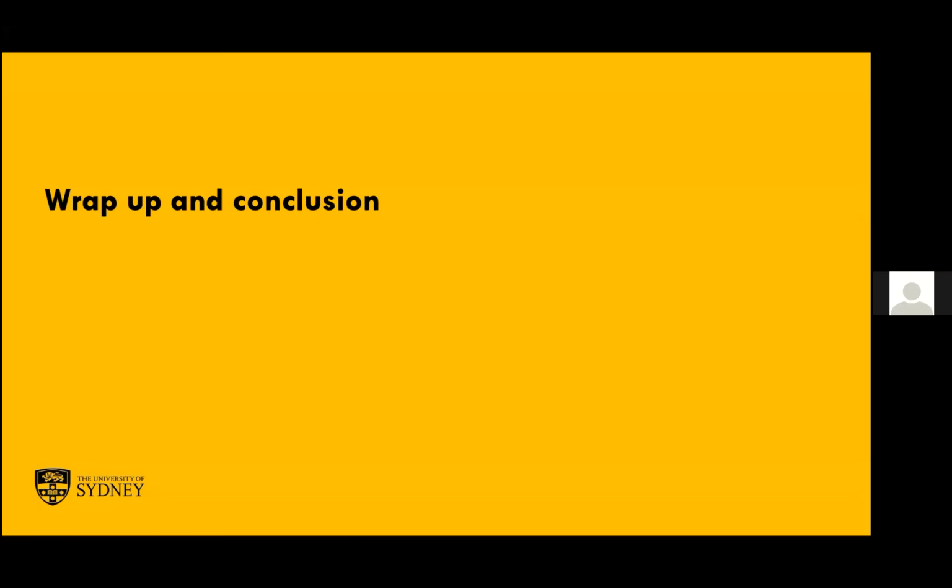Yeah, I asked the 10x people, they said they mainly use those isotypes for background correction. Yes. But I think there is another way you can probably use those as a normalization factor, right? Okay, thank you.